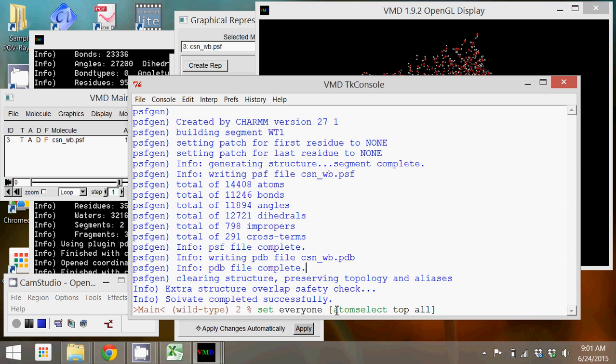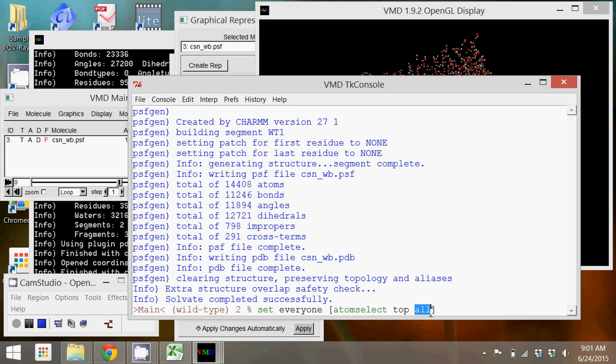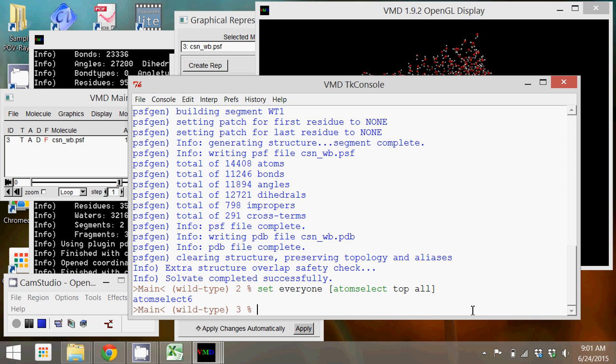I can then use the keyword measure, the minimum and maximum of that structure. That's going to give me the minimum and maximum XYZ of that structure, and I'm going to get that from my variable everyone. So the dollar sign just says get the data that's stored in the variable everyone. If I hit enter I get a set of coordinates.